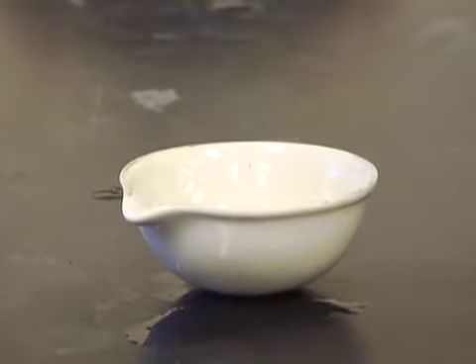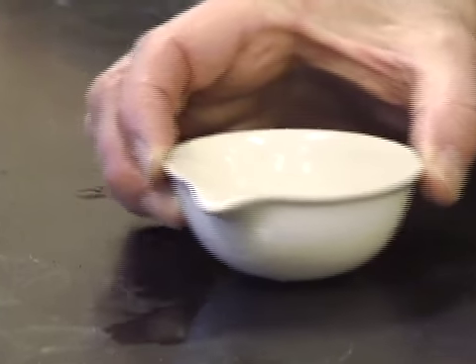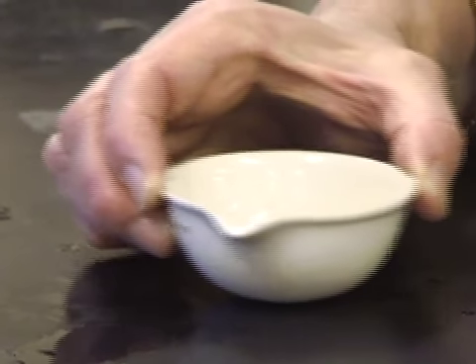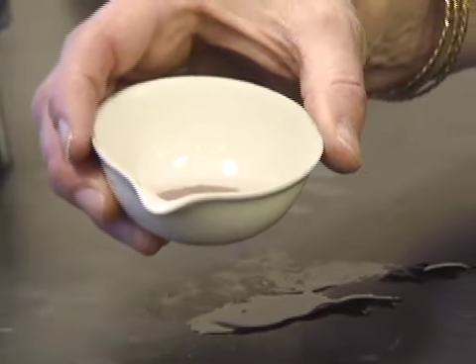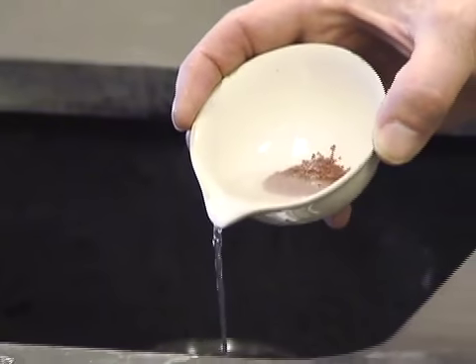And my particles are very, very light, and I'm going to stir it around a bit. And there's my solution. And now I'm going to decant that acetone off.